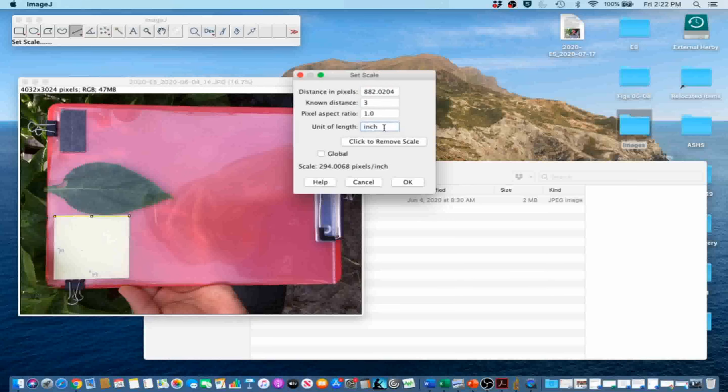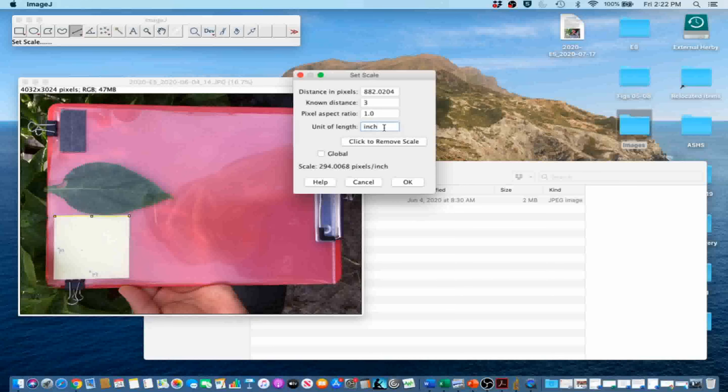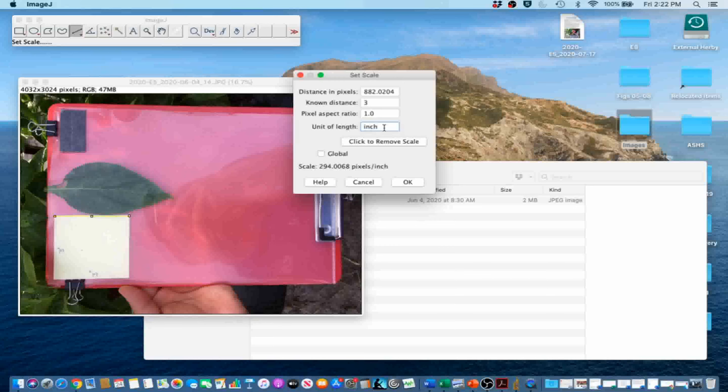We are going to leave the global unchecked. Regarding the global option, when the global option is checked, the same image calibration will be applied to images that will be imported subsequently until ImageJ is quit or a new scale is set. We are only analyzing one image at the moment, so we can leave it unchecked. Go ahead and click OK.